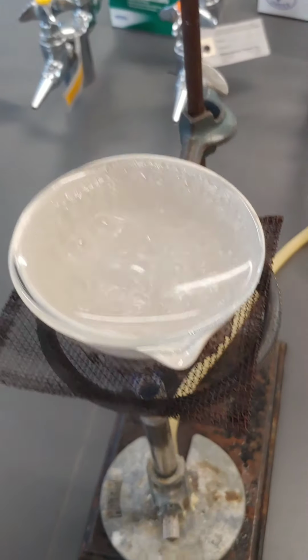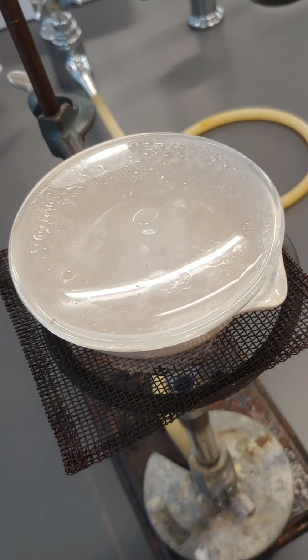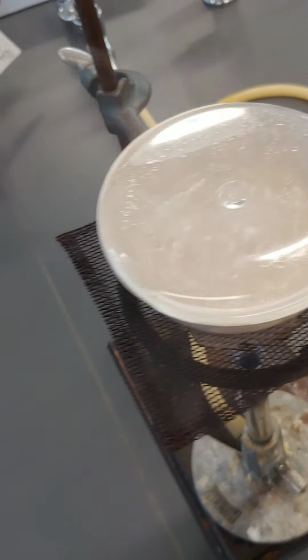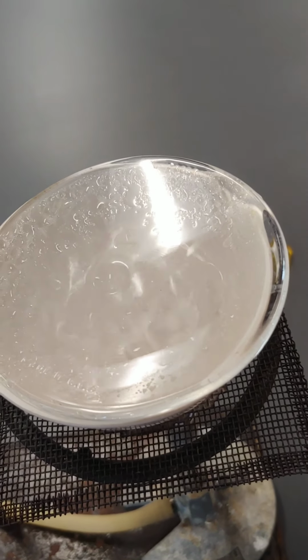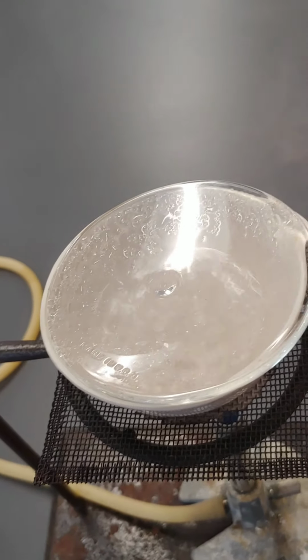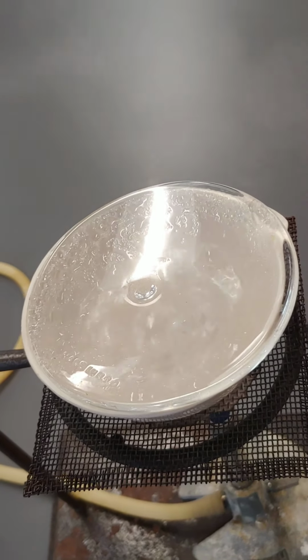Here is my saltwater solution. You can see the water is being evaporated off. You can see the water inside boiling nicely. You can see some droplets forming on the top of the watch glass, and so probably when this is all done, that watch glass is going to have a crusty layer of salt on the top, which again is why we weighed it beforehand, so when we're done we can just weigh this whole apparatus with the dish and the watch glass combined.